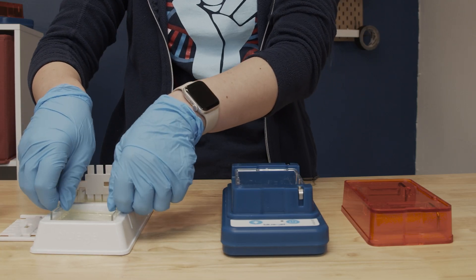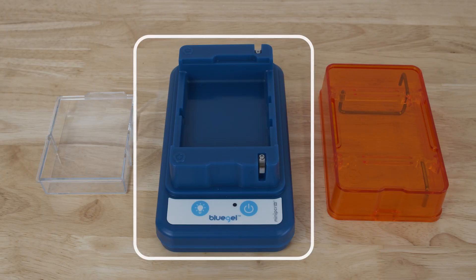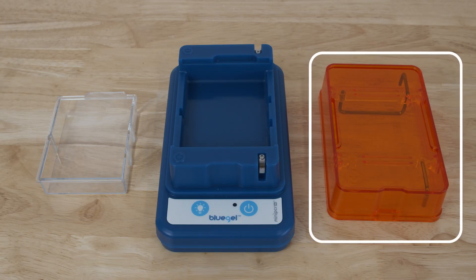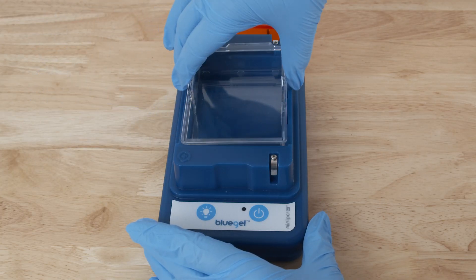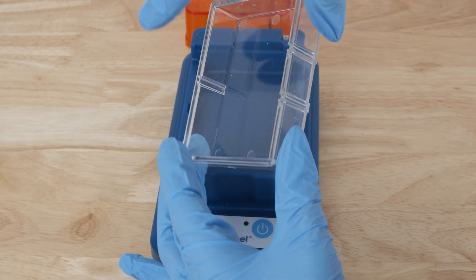Next, you will want to run your gel in the main Blue Gel System. The Blue Gel has a blue base, a clear buffer chamber, and an orange cover. To begin, place the buffer chamber in the blue base. Notches on the side ensure it can only be inserted in the correct orientation.